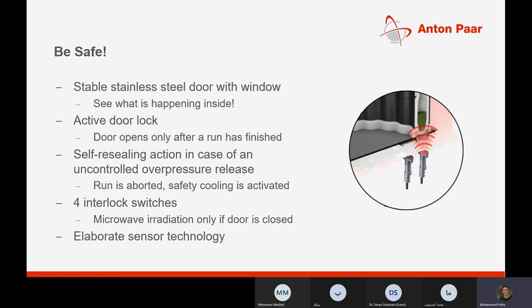The MultiWave 5000 has many safety standards, characteristic of Anton Paar instruments. It features a stable stainless steel door with a transparent window so you can see inside. There is an active door lock — the door opens only after a run has finished — and self-releasing action in case of any uncontrolled overpressure release. It also has four interlock switches ensuring microwave irradiation only occurs when the door is closed, plus elaborate sensor technology.